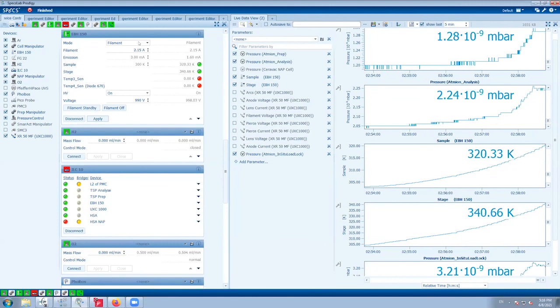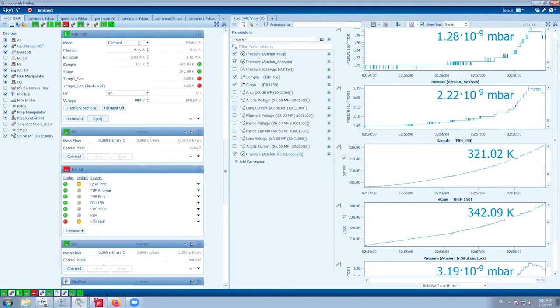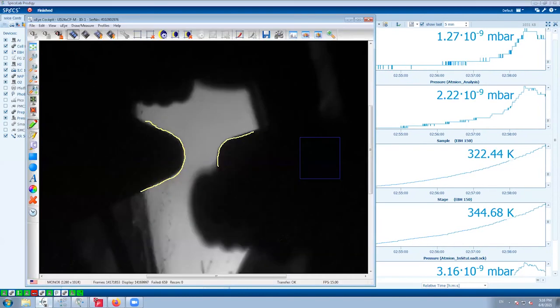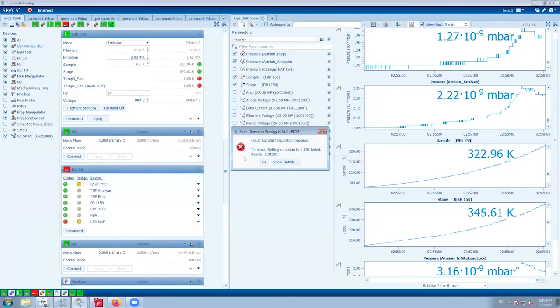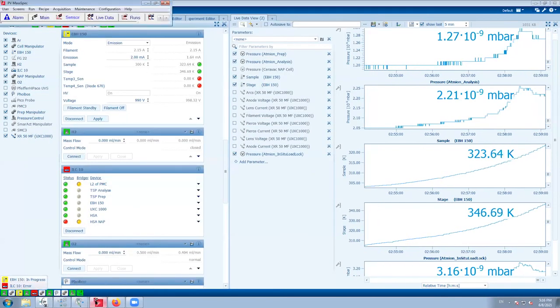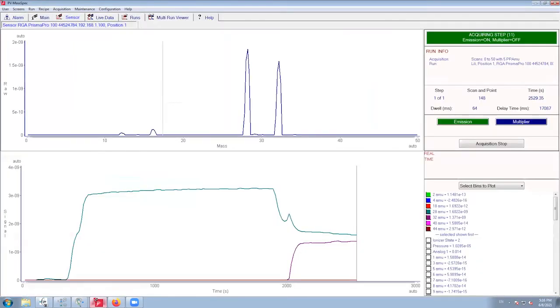Thermocouple pins and there are thermocouple wires, but usually I prefer not to use the thermocouple wires, but some kind of bolt which I connect to the pins. Then these wires can be used for applying potential to your sample and of course for measuring current. But this will be only a 2-point measurement. It's not like you make a 4-point measurement like a normal sensor.